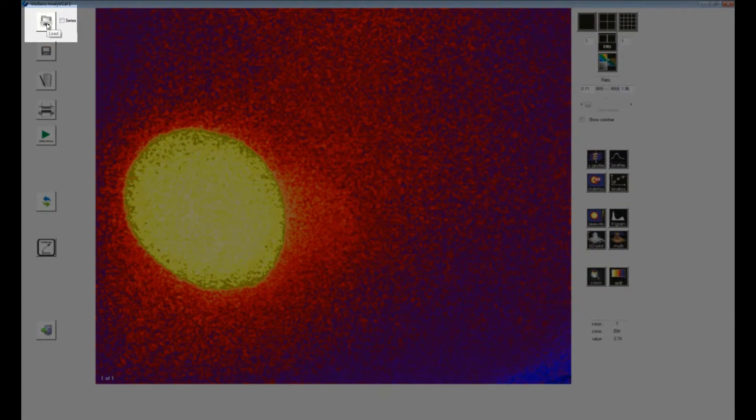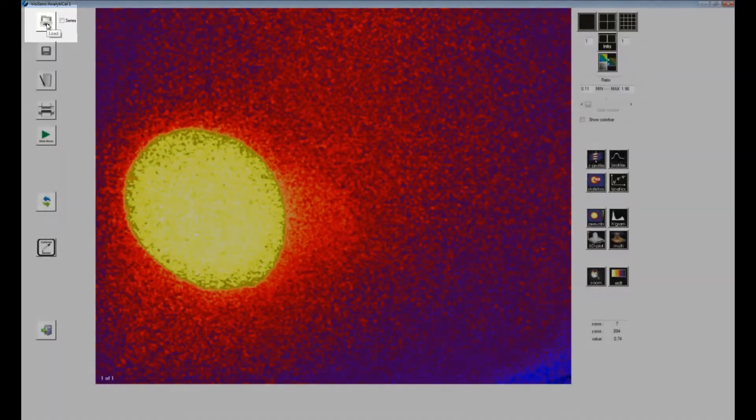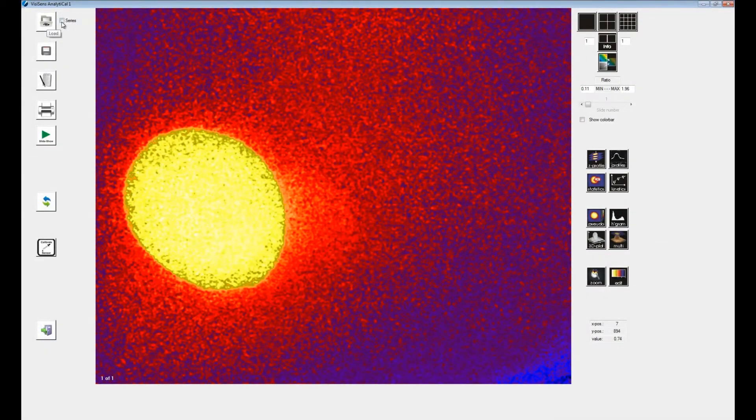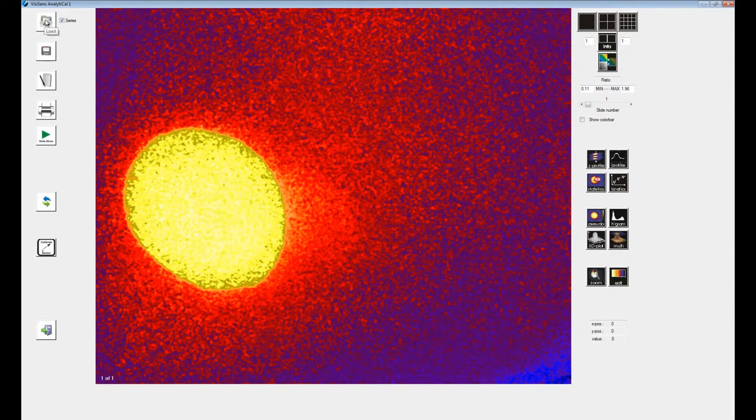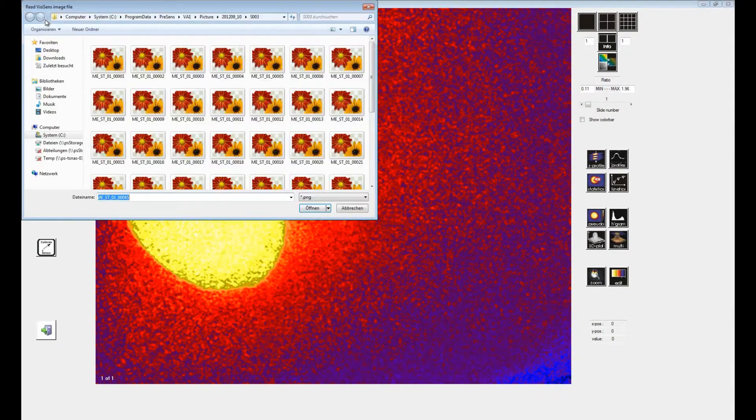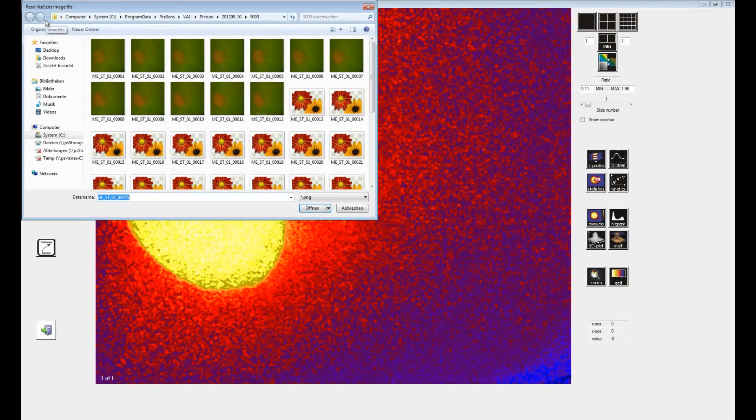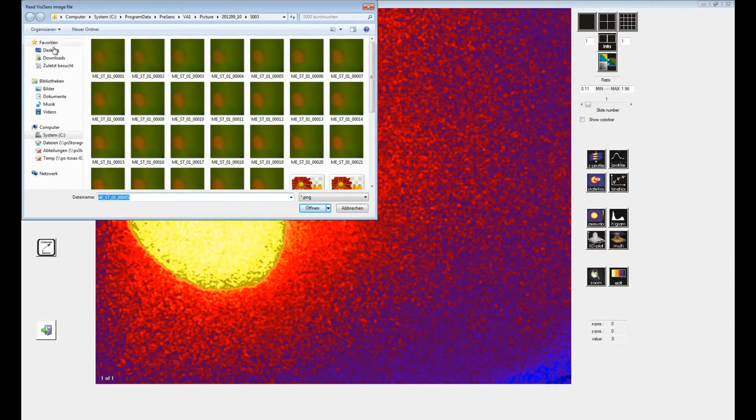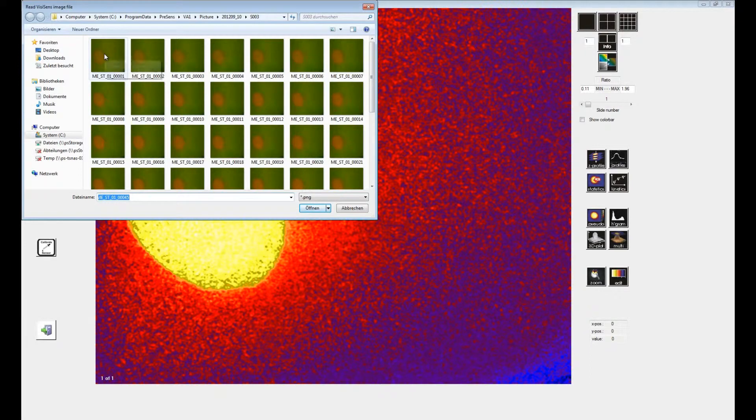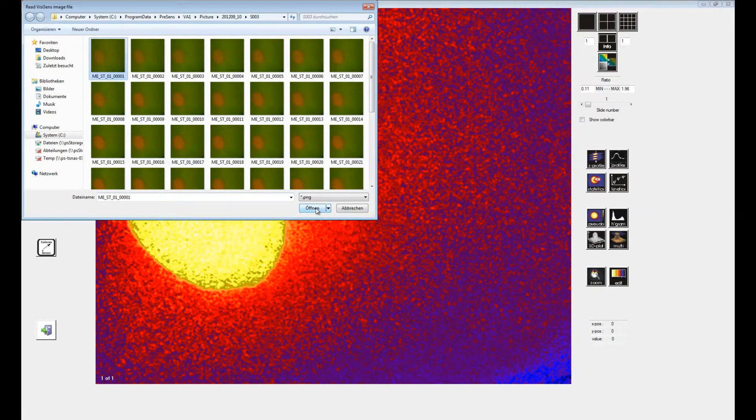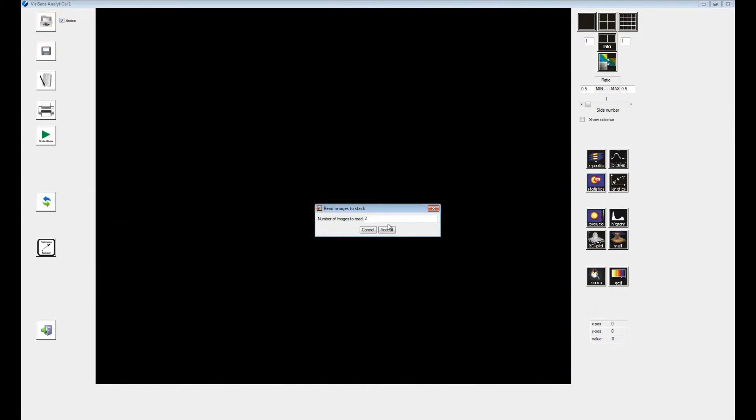In the upper left corner you will find the button for loading images. If you want to load a whole series of images, check the box next to it. The directory of the current session will be opened. Select the first recording and press open. In the next dialog, you can type in the number of images you want to load. In this case, we want all 45 images of our time series measurement to be loaded.